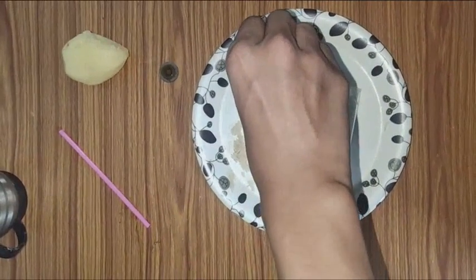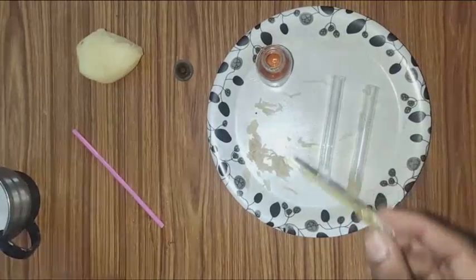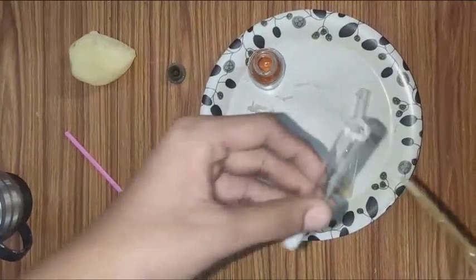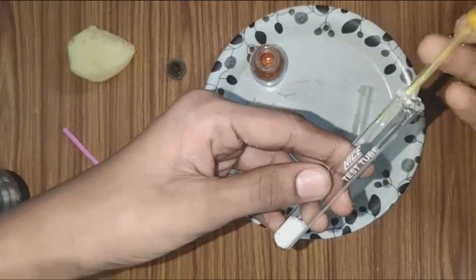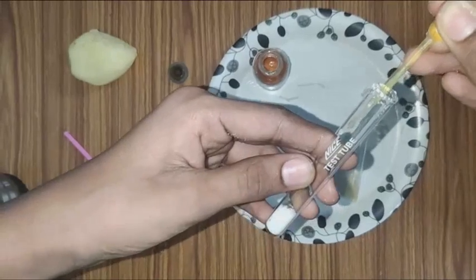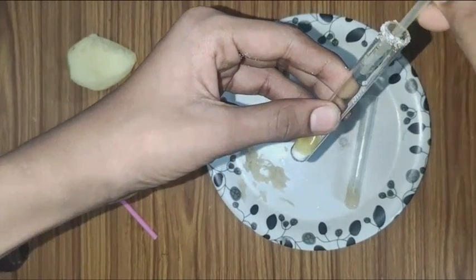Now, take test tube two which contains salt and pour a few drops of iodine in it. As you can see, I am dropping it inside the test tube.